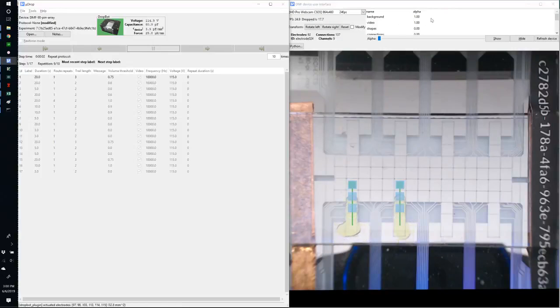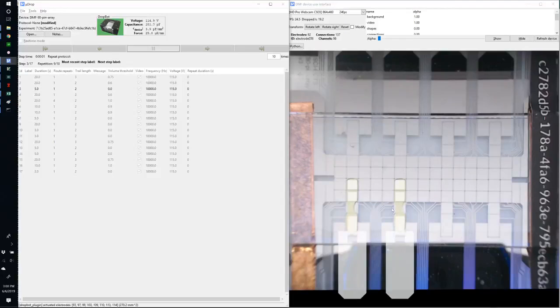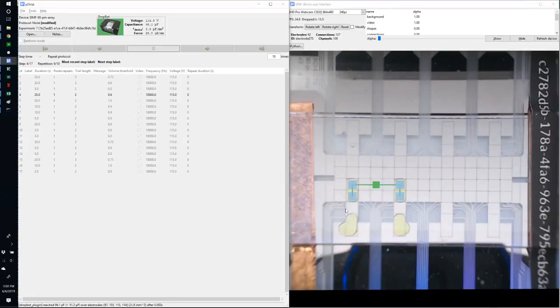In this video, I'm demonstrating a simple mixing protocol that is using timing for the dispensing timings here. So it's assuming 5 seconds to allow the split to occur on the dispense, and it mixes around 4 times, and then performs a split. We'll see it will align along the middle here and try to center the droplet volume, and then perform the split to try to get it as even as possible.